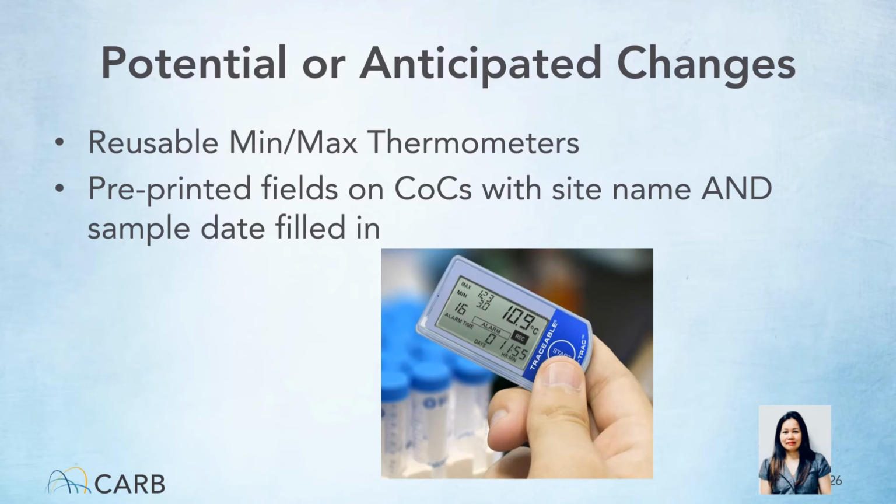In addition, continuous temperature data are able to be stored. Therefore, it is possible that samples arriving warm could be investigated to determine where and when problems occurred. Finally, they are reusable, meaning their implementation should result in cost savings over time. We are in the process of purchasing a small number to test before we move to full implementation.